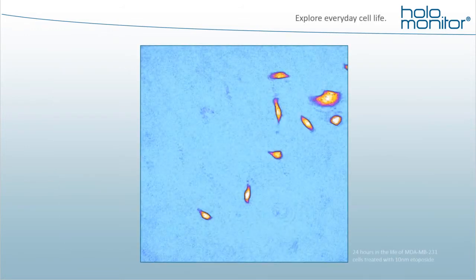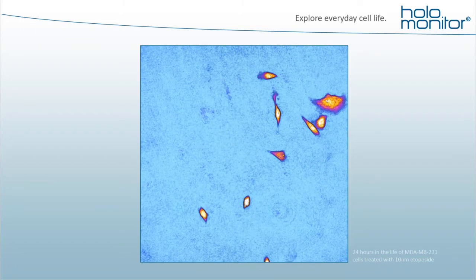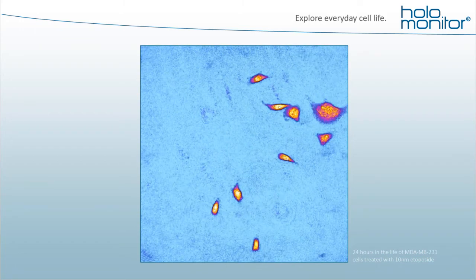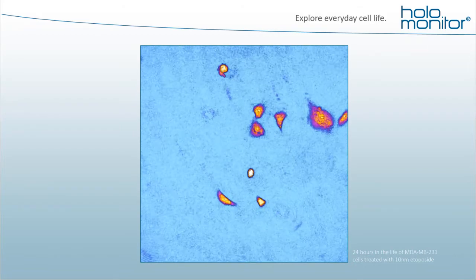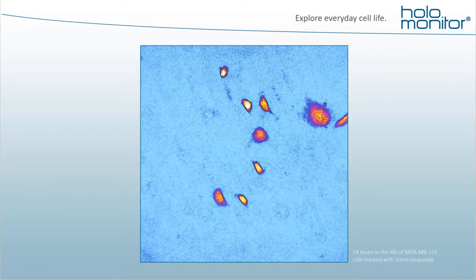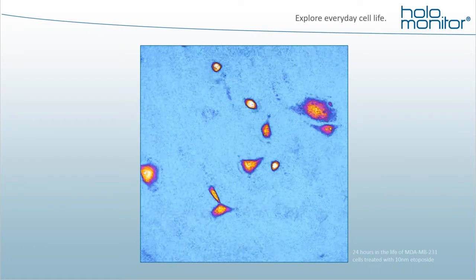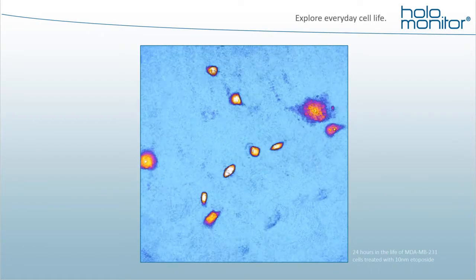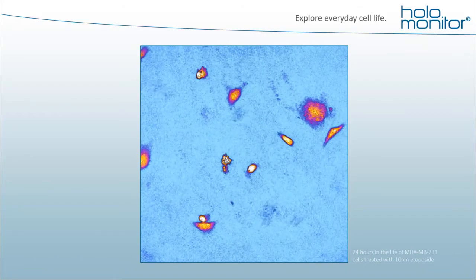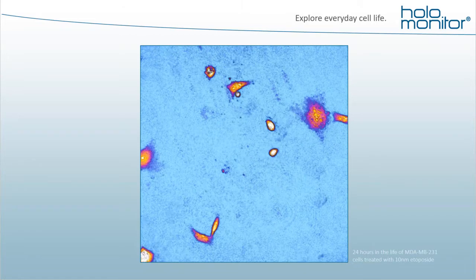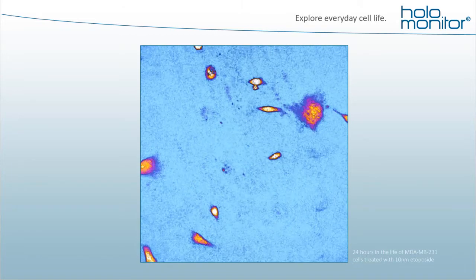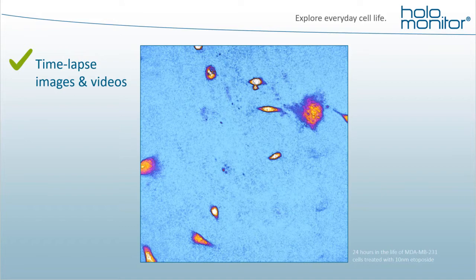This is a Holomonitor time-lapse video. We are able to follow everyday cell life events, such as growth, morphology changes, cell migration, or cell death. Keep an eye on the larger cell in the middle, which we are just watching undergoing apoptosis. Besides beautiful 3D images and videos of your cells, Holomonitor lets you collect real-time quantitative data on your cell behavior.